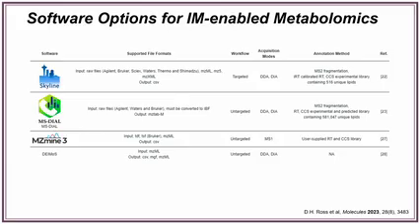So I'm going to cover quickly a couple of software options that we're not going to have presentations on today. These are, I think, 4 of the ones that I am aware of that are pretty much usable for anyone who's doing ion mobility, meaning if you're working with an Agilent instrument, a Waters traveling wave instrument, or trapped ion mobility, you should be able to use any one of these 4 platforms to do your data analysis. I haven't necessarily tried them all myself for all of that, but in theory they should work.